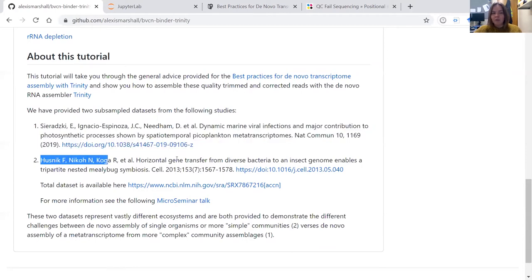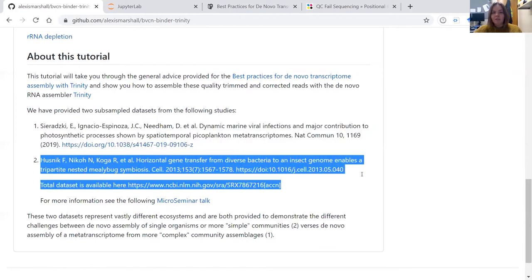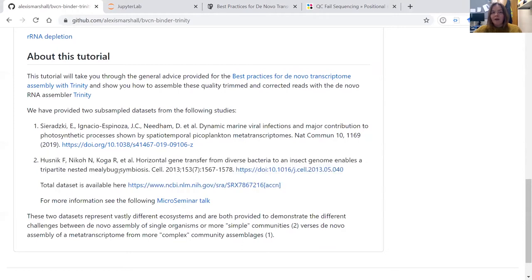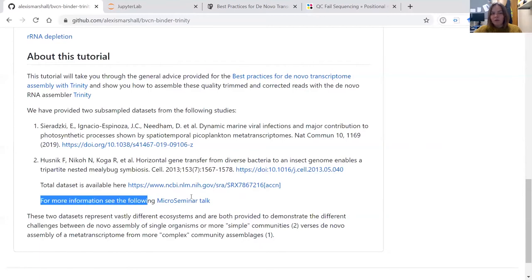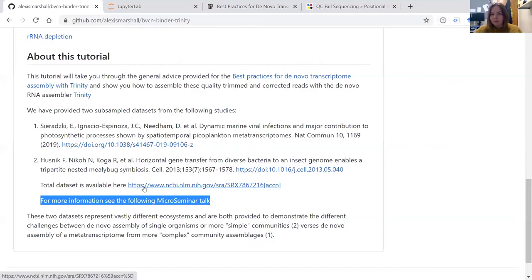Today we're focusing on this other dataset from this paper here. This RNA-seq dataset is from the mealybug - it's a eukaryote, but it has a lot of symbiotic bacteria co-associated with it. So you find transcripts associated with both bacteria and eukaryotes within this data. For more information, there's a micro-seminar talk that discusses this study in a lot more detail, and a link to the total dataset is also provided.